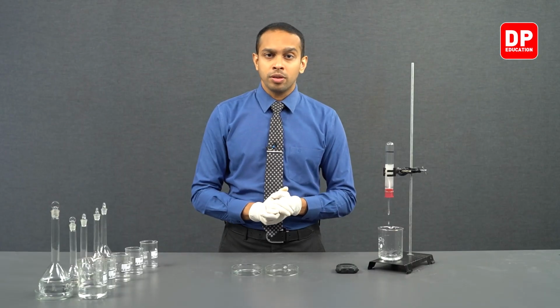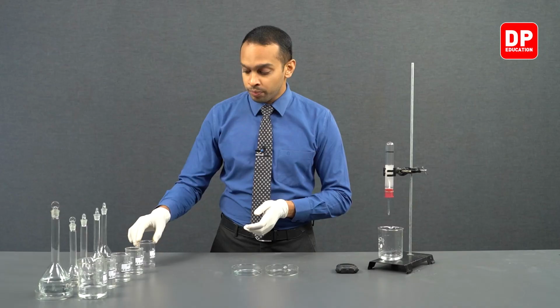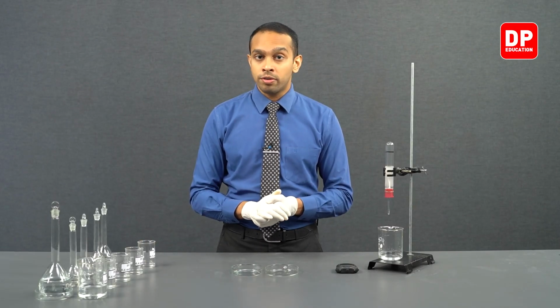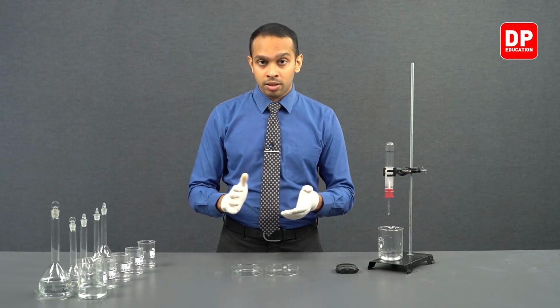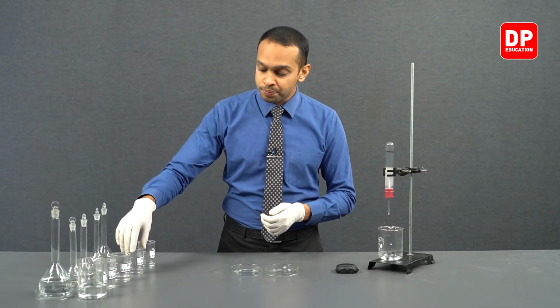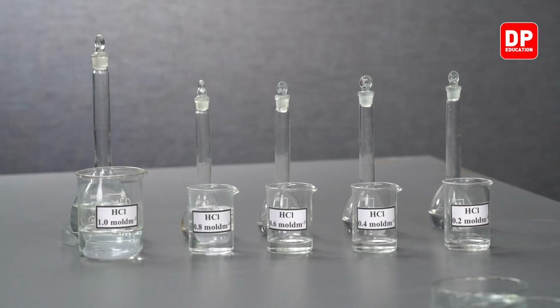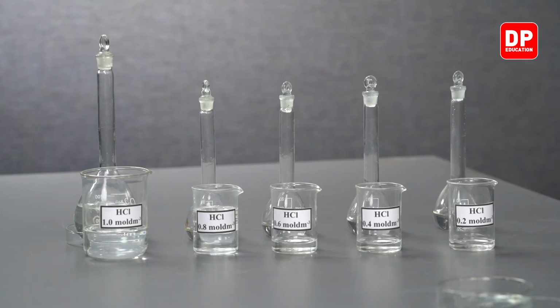Earlier on, the very first reaction we did with 0.2 M HCl, it took over 5 minutes. And the next time around when we used 0.4 moles per decimeter cubed concentrated HCl, it took a little over 1 minute and 30 seconds.